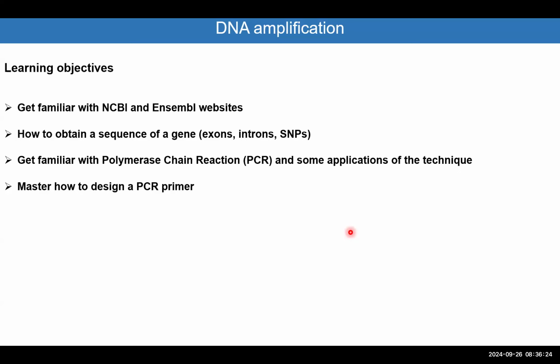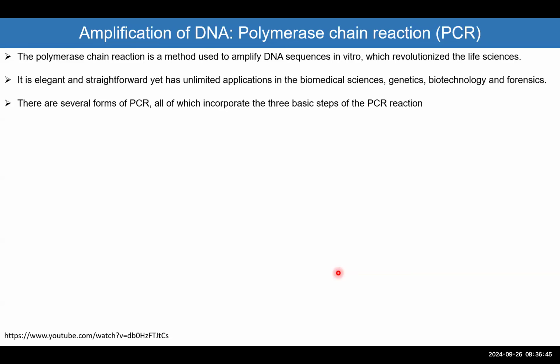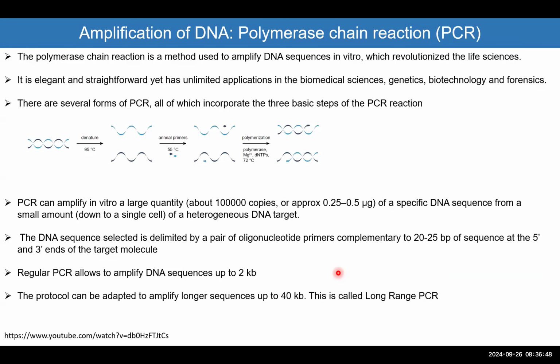As you remember, we discussed all the details of what is the PCR, how we can use it, where we can use it, what are the details, what is the steps of the reactions in terms of denaturation, then the amplification step, and then all the details we have to take in considering a PCR reaction. So we are not going to repeat this today. We mentioned what are the main parameters we have to take care of and how we perform a reaction. And we discussed the 3-4 different steps in the PCR design.